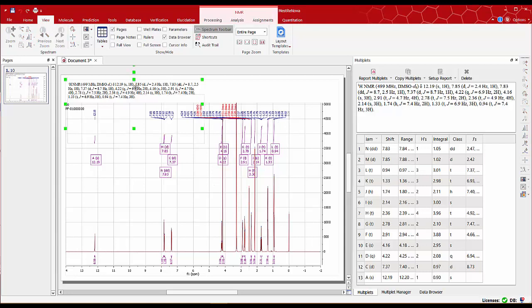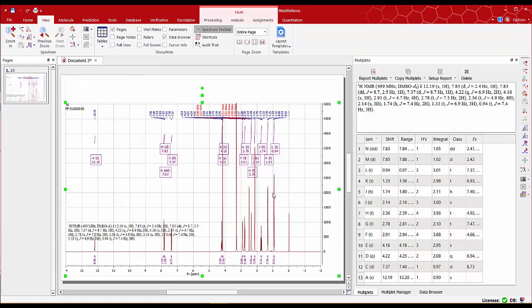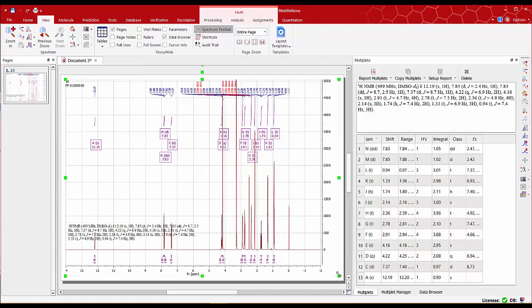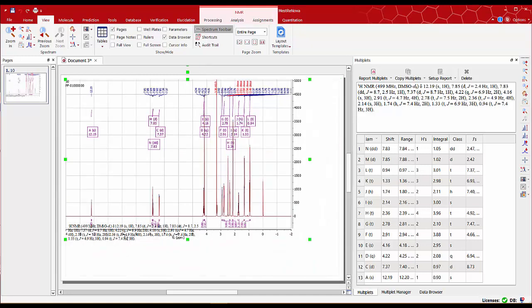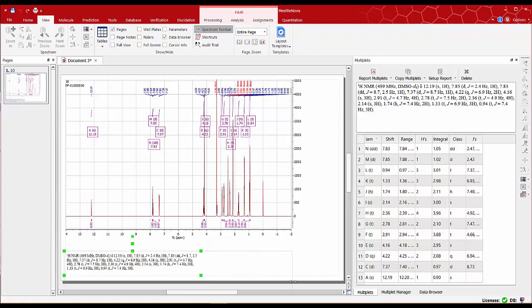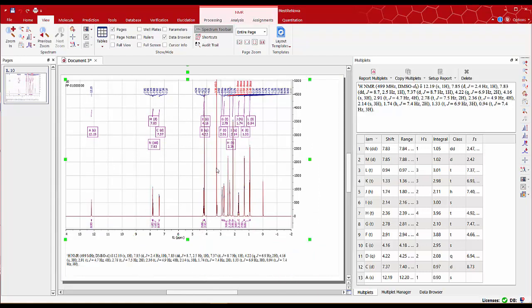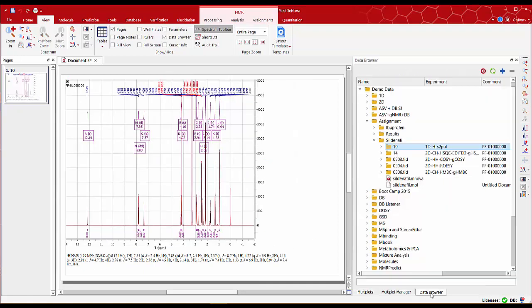We can resize this and leave some space for the structure. Then drag the mol file with your structure.